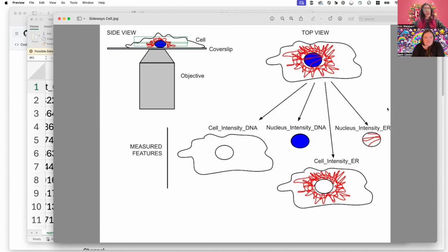Good point. We'll also have an episode coming up soon about how you can modify the cell painting assay and talk about wide field versus confocal. But our standard cell painting assay is wide field, so we are getting all of this extra information. Again, great point. It could be handled differently, such that you could end up with a different way of imaging here. This is just not what we're usually working with.